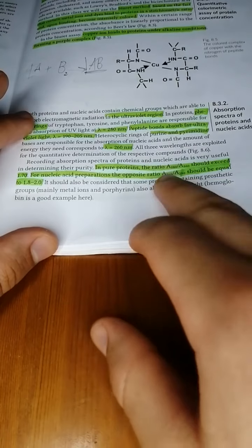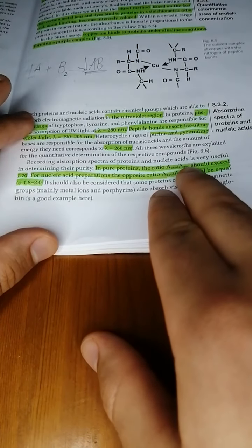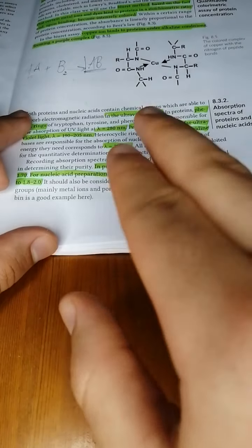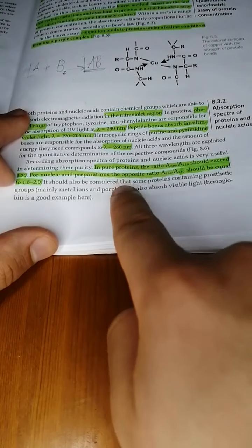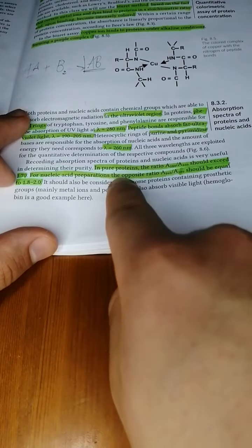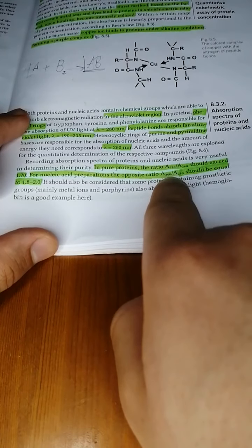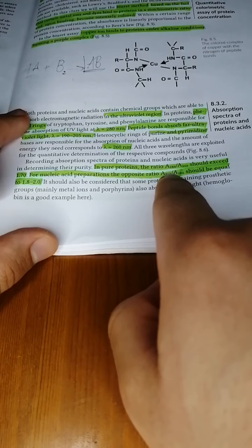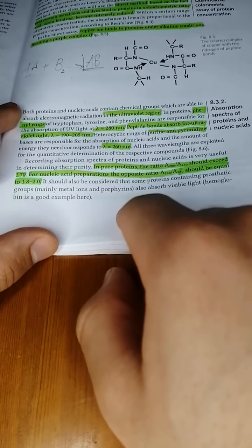The ratio of absorbance at 280 nanometers compared to 260 nanometers for proteins, by the way, is 1.70. And for nucleic acids, the absorbance at 260 compared to 280 would be between 1.8 and 2.0.